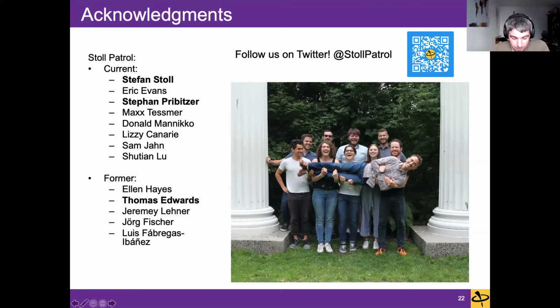Yeah. Hi, Sarah. So this was a really cool talk, especially because it was really helpful for me to understand some of the stuff about the uncertainties. And my first question would be rather simple. Is it possible to estimate a plus-minus value for a specific parameter? So to say the position of the Gaussian is at this position plus minus half a nanometer from your analysis.